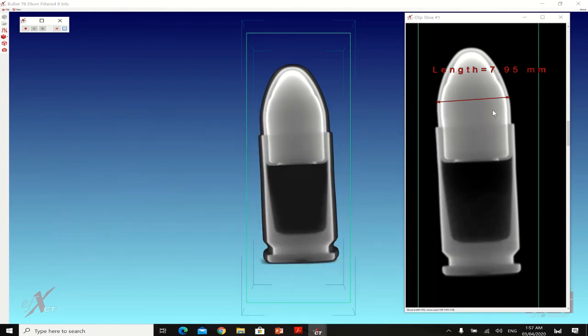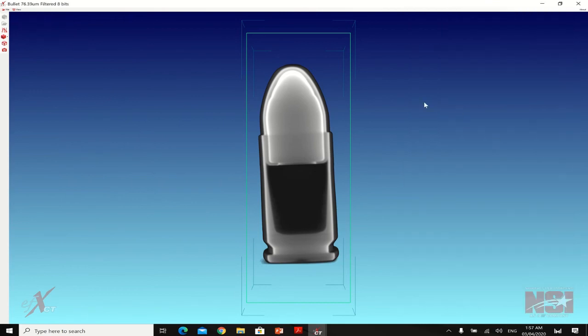So going back, we have to close this, and doing snapshots is also the same in the 3D view. So in this 3D view, you can also do video capture and snapping on the 3D volume. Okay, so I will not explain it further, but this is quite easy to do.